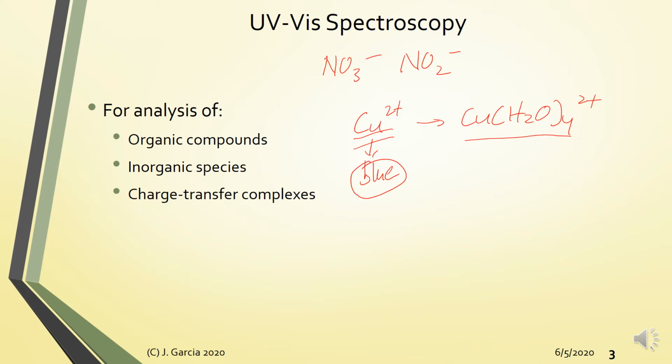So later, kung babalikan natin yung experiments natin noon, one example of a colored or visible light absorbing charge transfer complex would be your iron phenanthroline complex. If you want to analyze iron as your analyte, although colored ang iron in aqueous solution, medyo may at higher concentration yellow yung ferric form, but at more dilute concentrations, the intensity of the color is very weak.